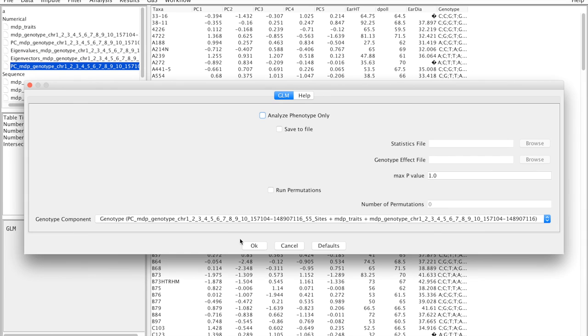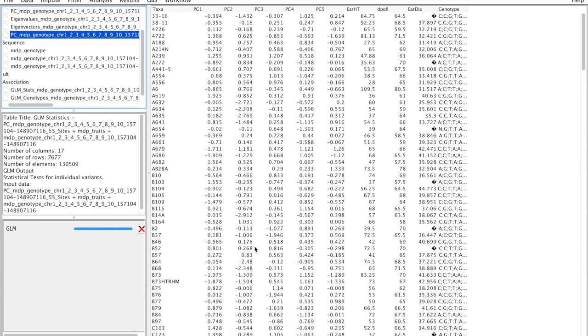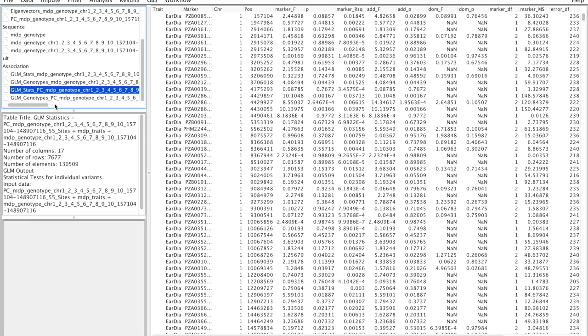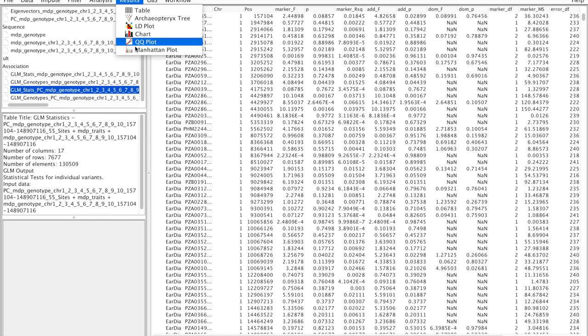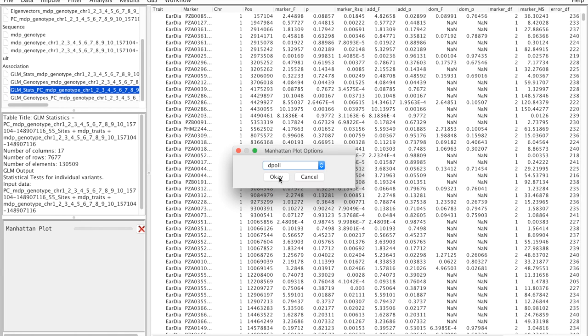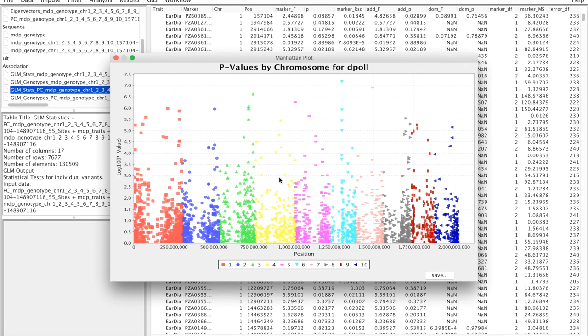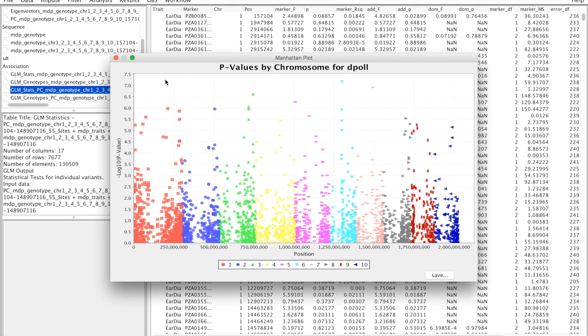Okay, and finally we have a new table that includes the principal component analysis. And on the Results and Manhattan Plot we can select again days to pollen, okay. And we have significantly lower p-values. The Manhattan plot is different but this is because it's accounting for some of those differences that are population structure related. So those could potentially be false positives in the original model and now we're controlling for that.